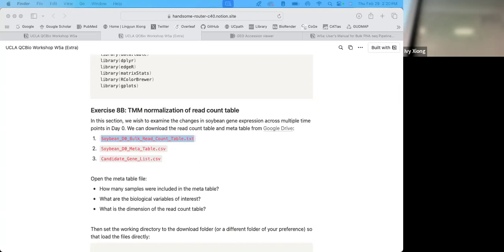Now you're working in R for this bit. I think we're going to download it from the Google Drive. Yeah, I think something went wrong. You have to troubleshoot a little bit, like why it didn't install successfully. It's normal. It was quite straightforward for me when I was doing that, and I'm using the same version actually. So maybe there are some GCC issues with your laptop.